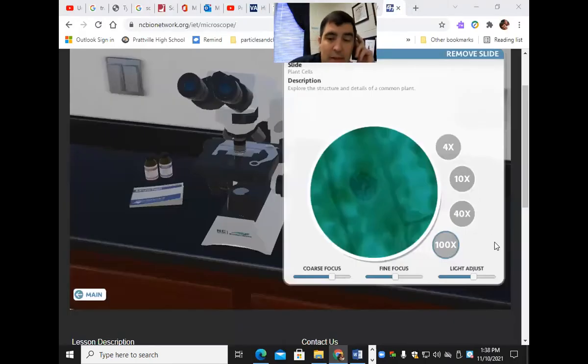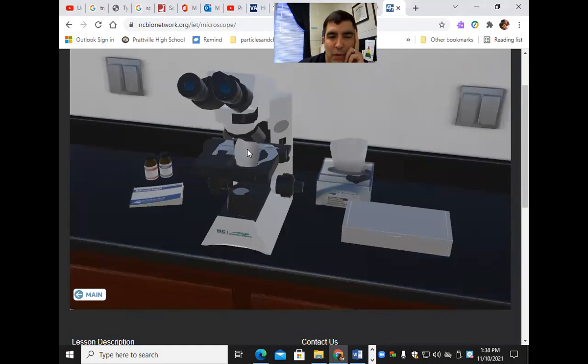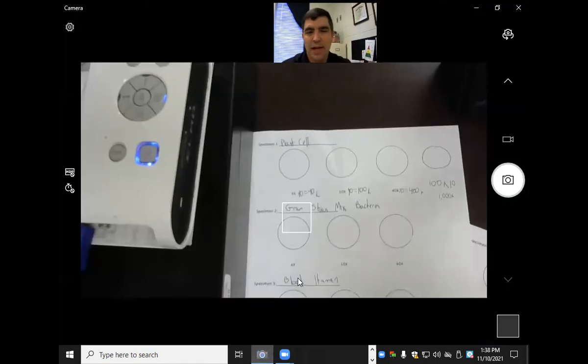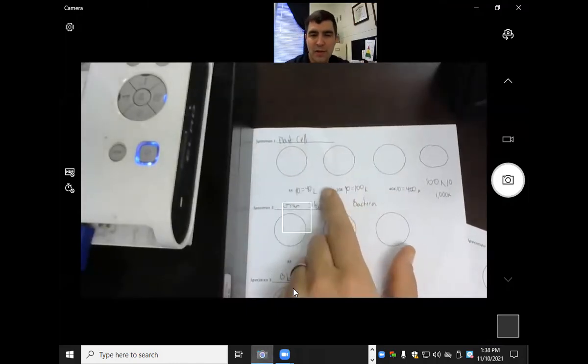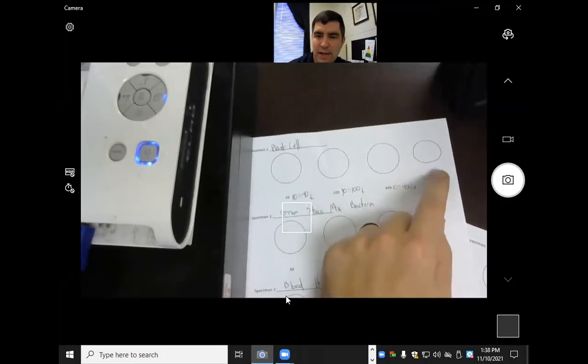Once you're done right here, you'll see that we are done with this slide. Once you're done with the oil immersion lens, you have to wipe it off with tissue paper. Then you're going to be doing the plant cell under 4x, 10x, 40x, and 100x.